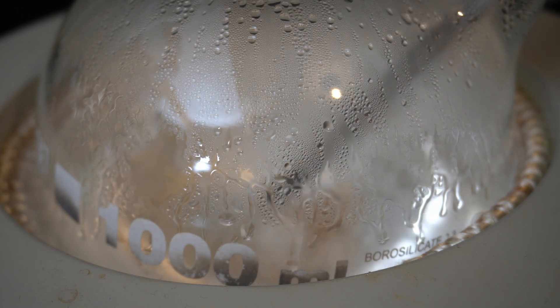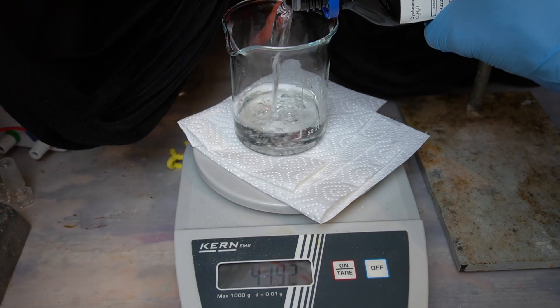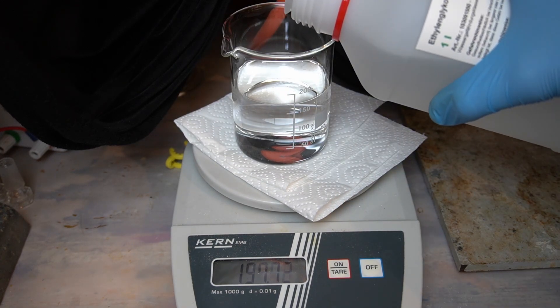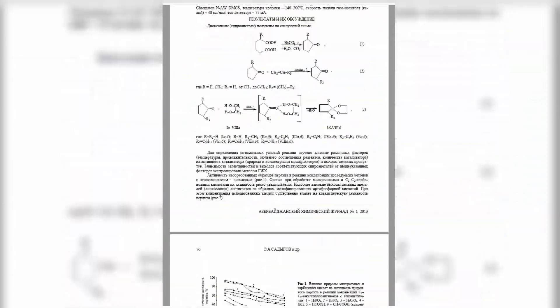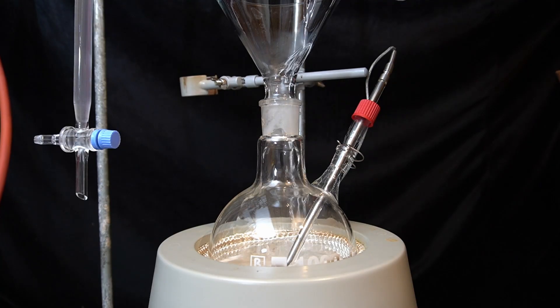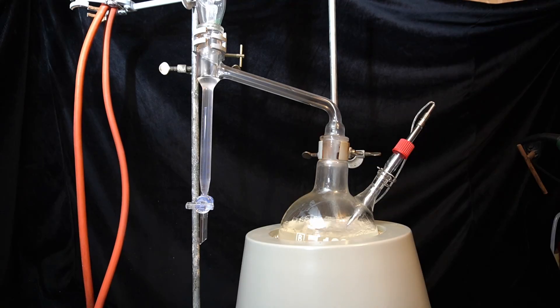You probably noticed that I'm running the apparatus without the reagents added. This serves the purpose of removing the water from the PTSA, as it's sold as the monohydrate, which is insoluble in toluene. Now that that's done, I weigh out 127 grams of cyclopentanone and 200 grams of ethylene glycol. I'm using a double molar excess of ethylene glycol, because according to a Russian paper I found, this significantly improves the yield. Both reagents are added to the reaction flask — a separate layer can be observed at the bottom of the flask, which looks quite nice. The heat is turned up to get the toluene refluxing. This will now run by itself, so I'll just leave you here with the thing and go make myself some dinner.